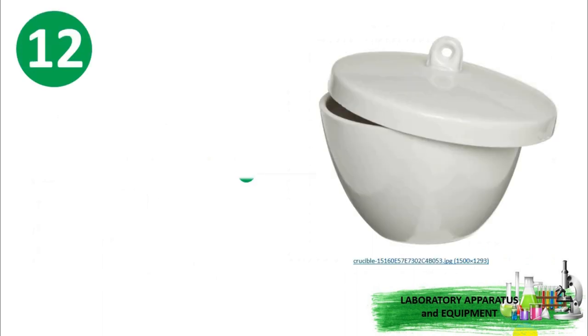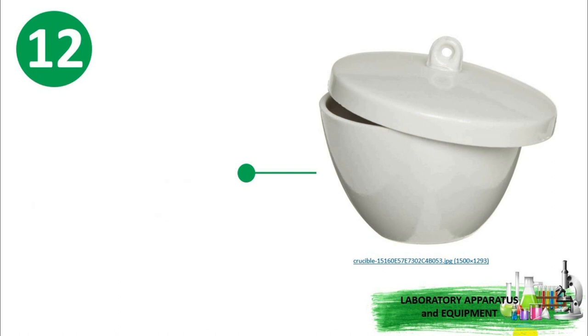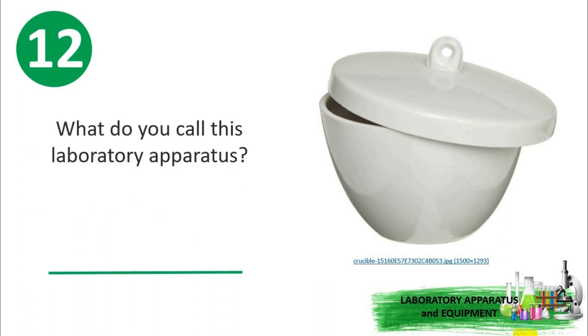Number 12. This is made of thin-walled porcelain. This laboratory apparatus or ceramicware is used for heating small amounts of materials at very high temperature. The cover is designed to fit the container to prevent loss of materials. What do you call this laboratory apparatus?